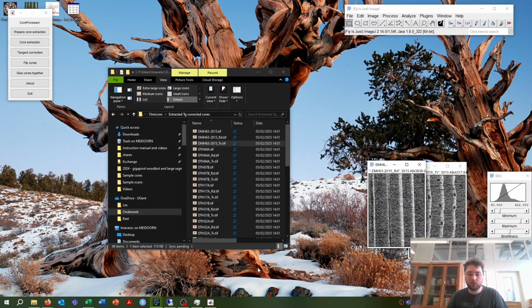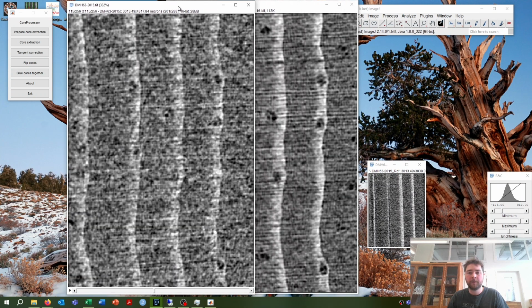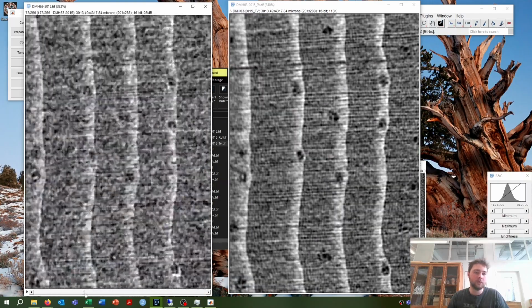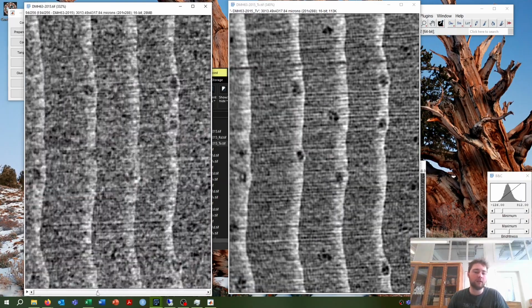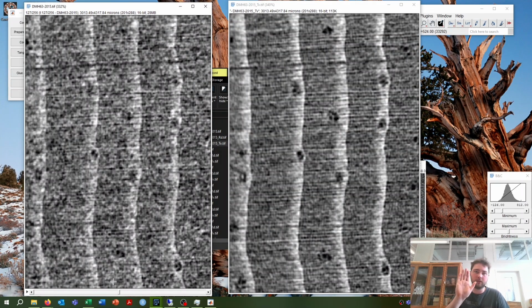This one looks a little bit noisy, much more noisy than these. I will make them bigger. Okay, so this one looks a lot better than this, because this is actually the 10 middle slices averaged out. Because we have super high resolution, so super thin slices, every slice only has a limited amount of information. But we will always just average out in the Z direction to make the CT scans more clear. So it will look like this when we open it in a program.